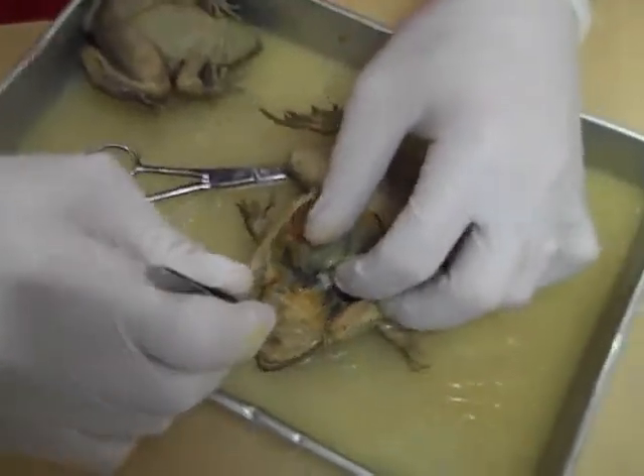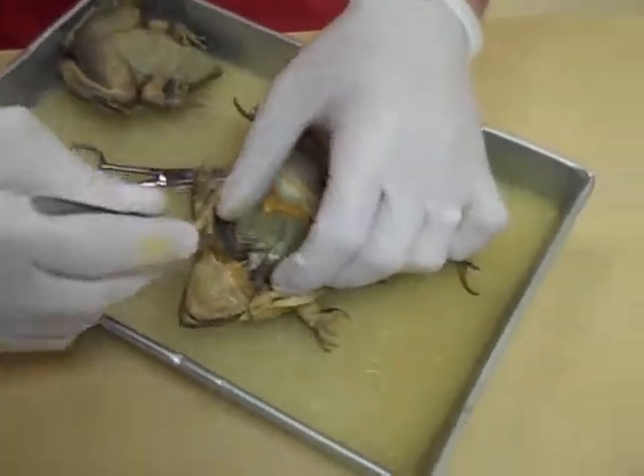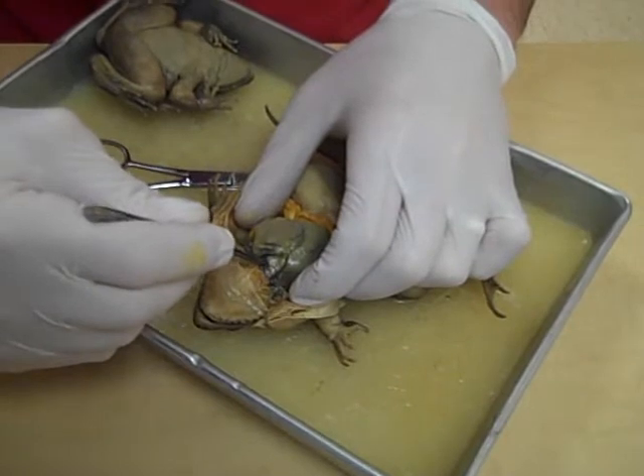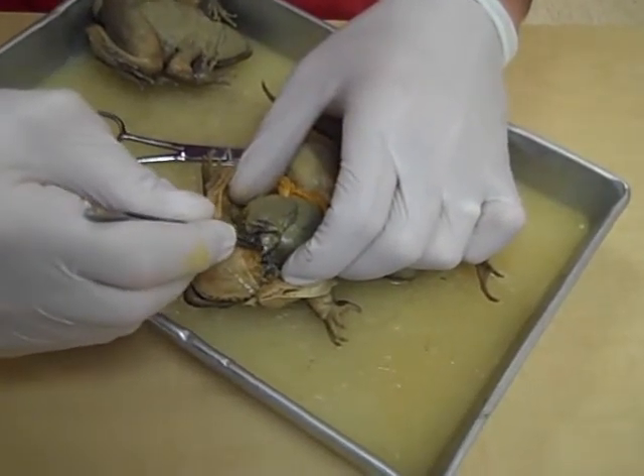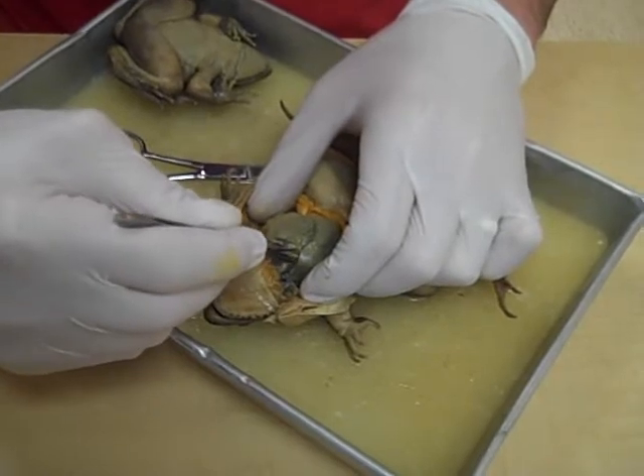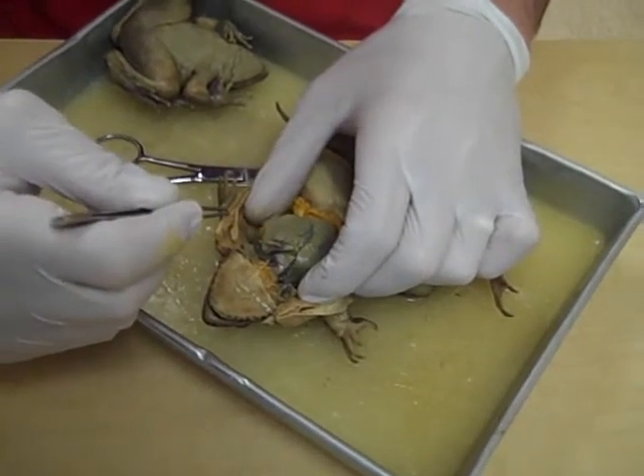Now the first thing we'll look at is the heart, and the heart is right here. It's a little bit damaged, one of the atrium. But there's the heart right there — it's in a sac just like ours is. We've got two atria and a ventricle, quite a large ventricle.